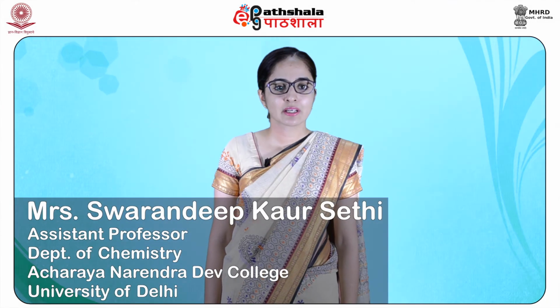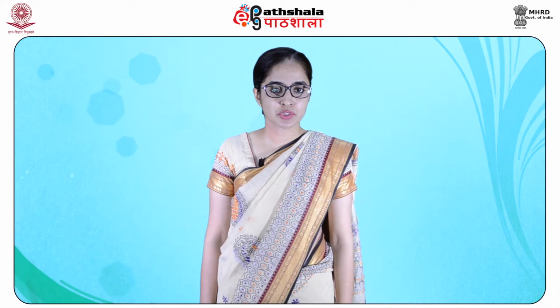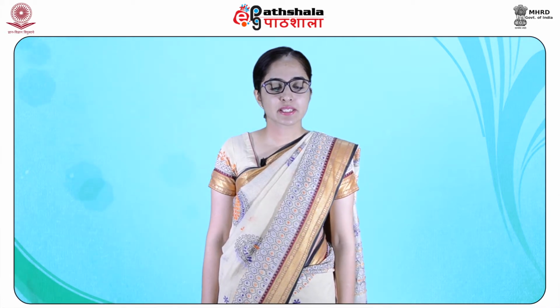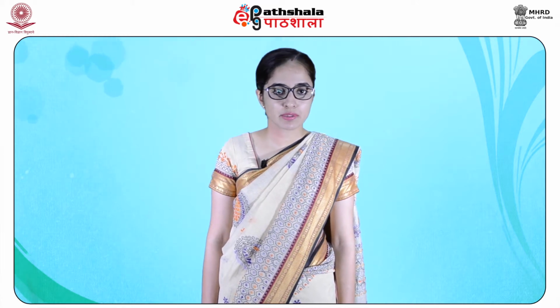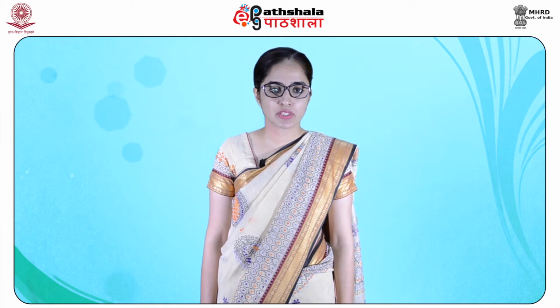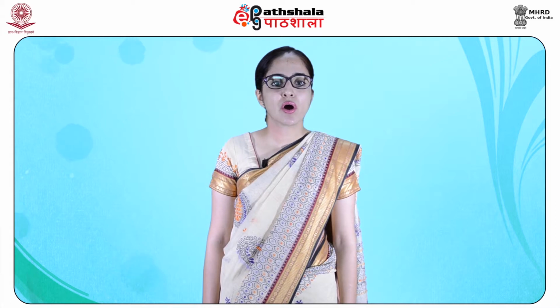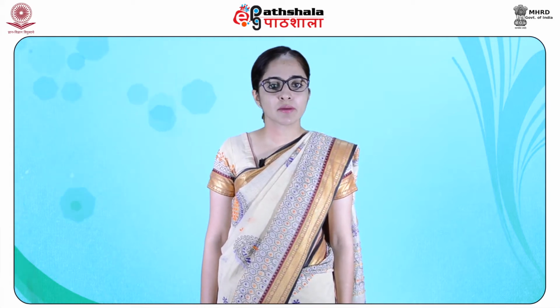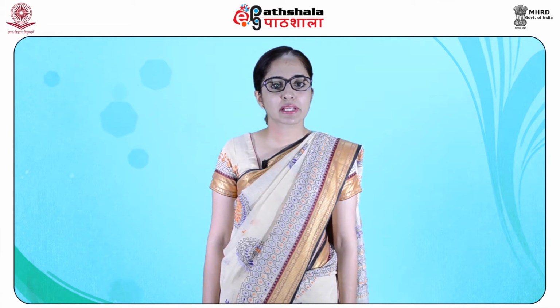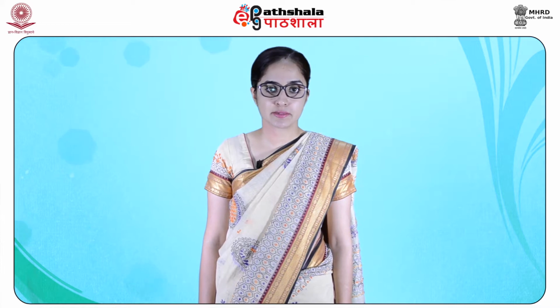Dear students, after studying this module, you shall be able to understand simple and complex splitting patterns of various compounds, understand the first and second order spectra, understand the nomenclature of various spin systems, and also you will be able to know about the magnetically equivalent protons in aliphatic and aromatic systems.